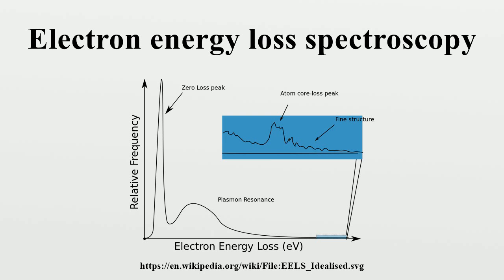Thickness measurements. EELS allows quick and reliable measurement of local thickness in transmission electron microscopy. The most efficient procedure is the following. Measure the energy loss spectrum in the energy range about -5 to 200 electron volts. Such measurement is quick and thus can be applied to materials normally unstable under electron beam. Analyze the spectrum. Extract zero-loss peak using standard routines. Calculate integrals under the ZLP and under the whole spectrum. The thickness T is calculated as the MFP times the natural logarithm of the ratio of the two integrals.